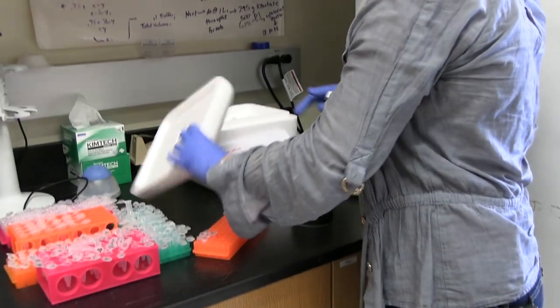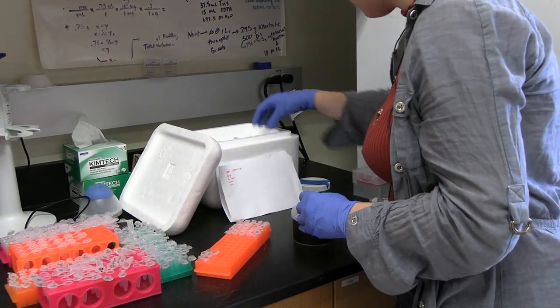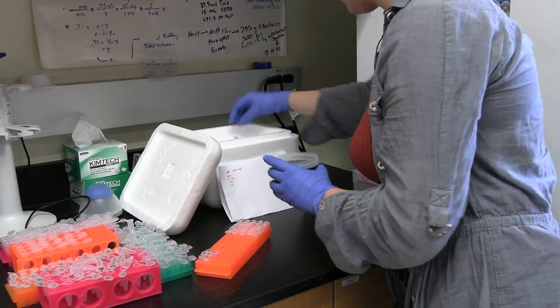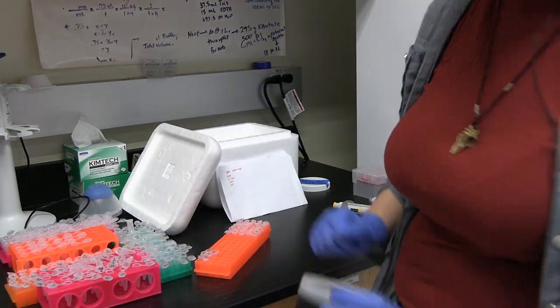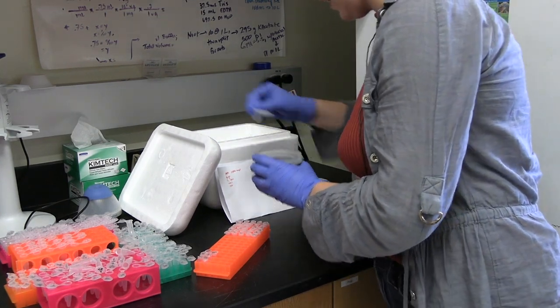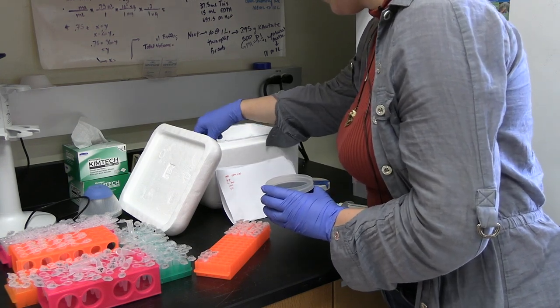And then I have all of my fun aliquots here. I'll just throw them in. I'll try to do this quickly so that nothing defrosts. And then I also like to keep the empty stock vial in the container with the aliquots just for reference if we need it later. Throw all these in, try to get as little ice as possible so it doesn't kill the desiccant on the first day.